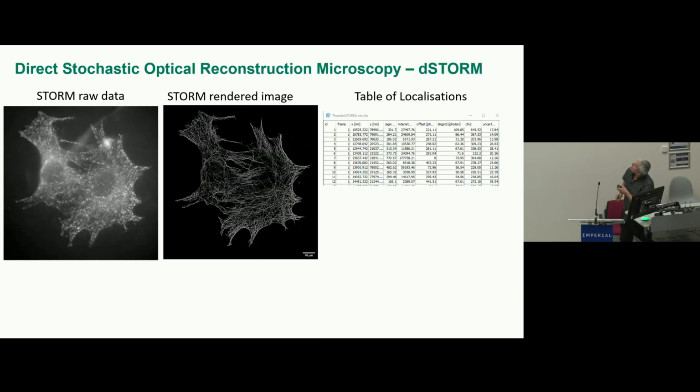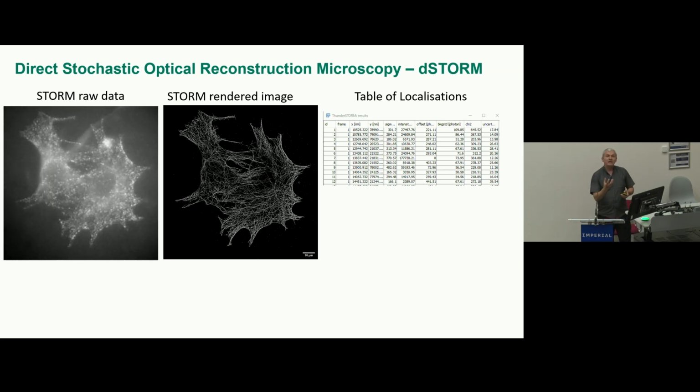Let me continue. Based on this, this is how we illuminate the biological sample with a constant illumination. This is using the Alexa Fluor 647 dye, and you can see a cell here that we labeled with conventional antibodies; conventional immunofluorescence works with this technique. And when you have this higher irradiation, you can see every single molecule emitting some photons. And then we usually take between 30,000 to 50,000 images separated by 30 millisecond integration.